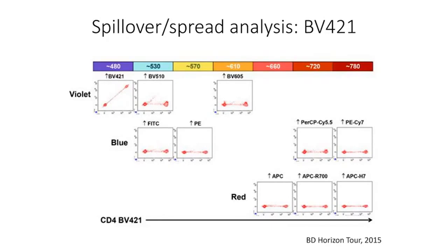It turns out that on the y-axis, there's really not much variation of the strongly positive CD4 cells compared with the negative cells. And that holds true for all the other fluors pretty much for BV421. So the positive and the negatives, they look similar in the y-axis. So we are not having much spillover and the consequent spread in those other channels.